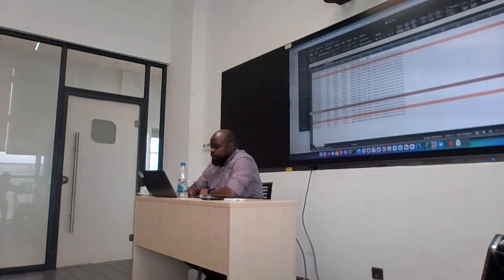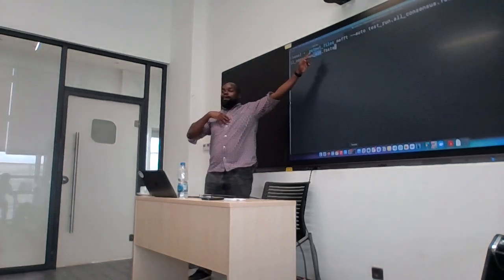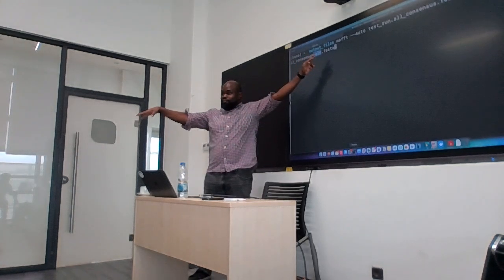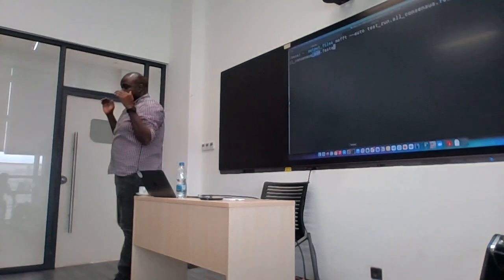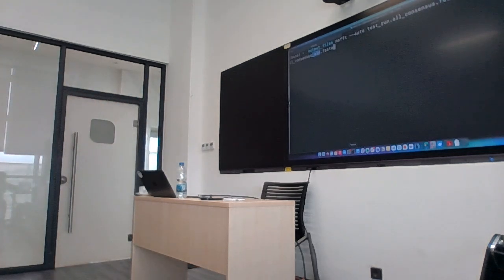All right. Are we running MAFFT? I was already in my output directory. So if you're in a different directory, remember about the paths. Be sure that you specify the path if you're not in the directory where your file is.